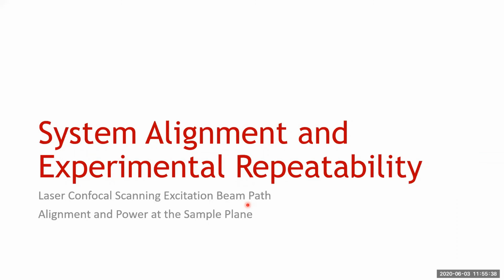That being said, it's always good to take a high bit depth image or use that full dynamic range, because at any point afterwards, you can downsample. That's not the best thing to do, but you can downsample the image from 16-bit to an 8-bit image, and you lose some stuff in there. There are ways around it. You can do what I just said, or we're going to make it so that you can remote into a better computer.